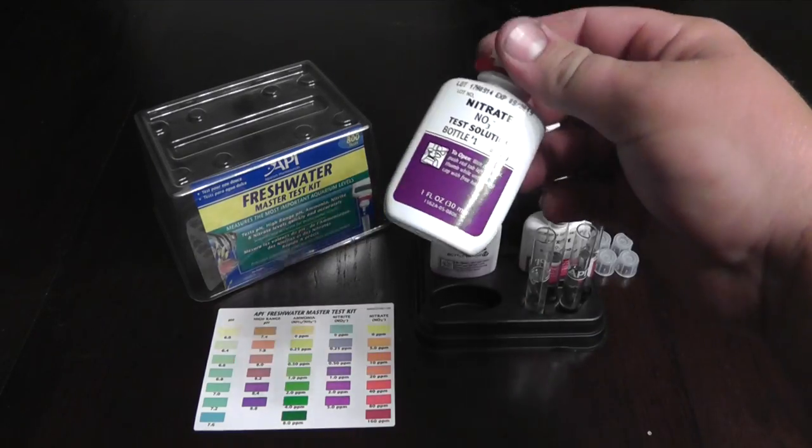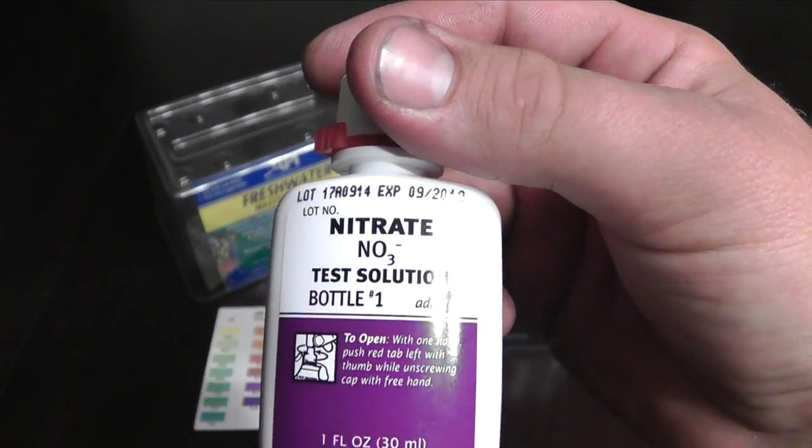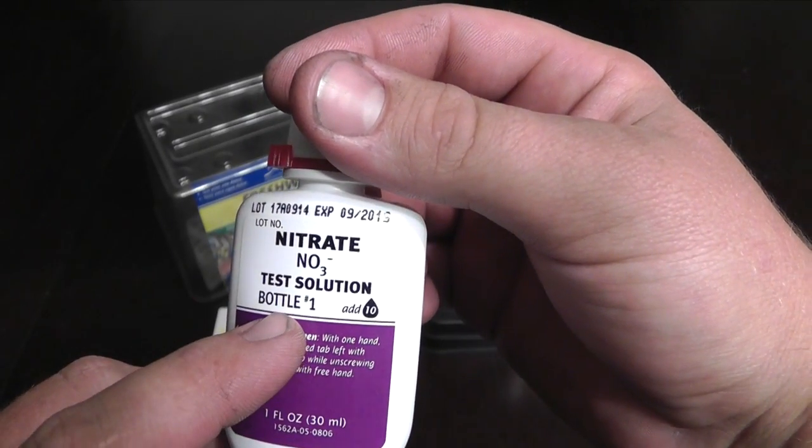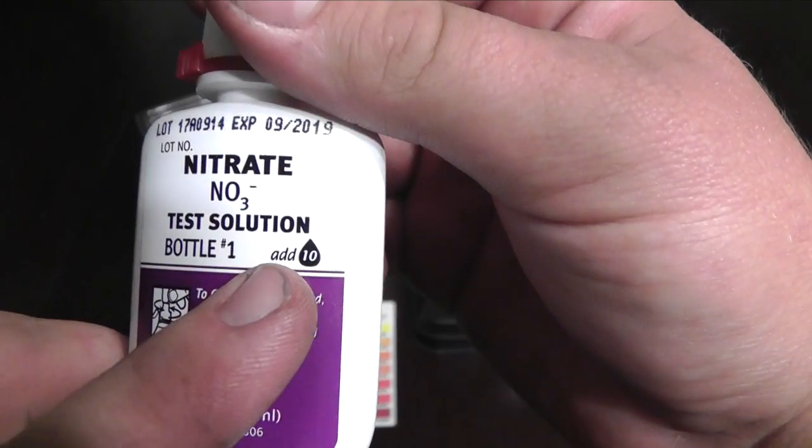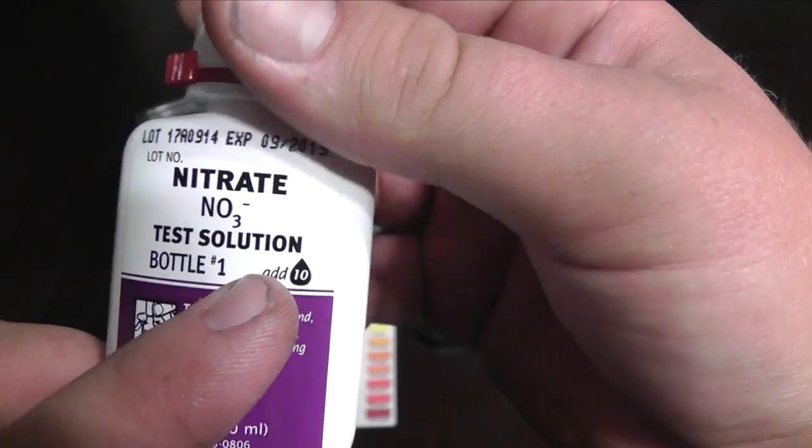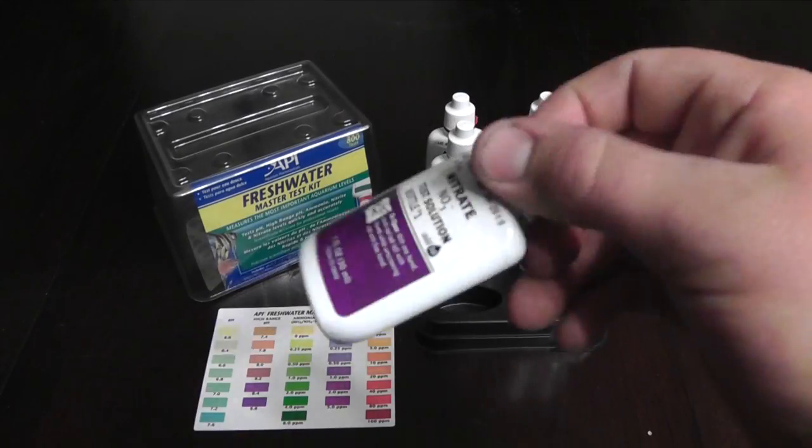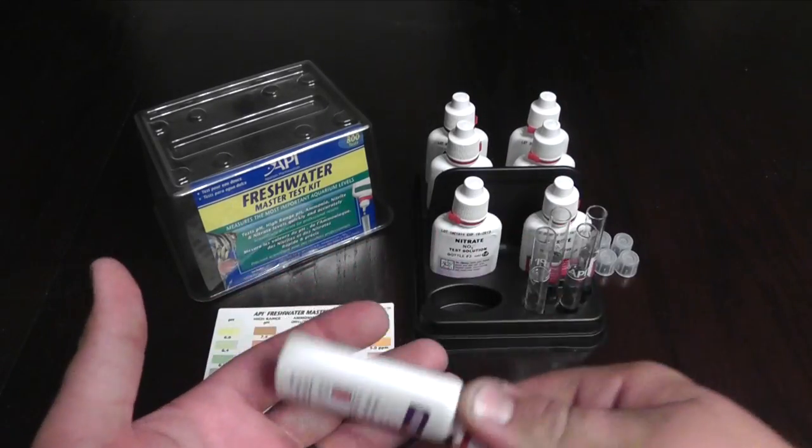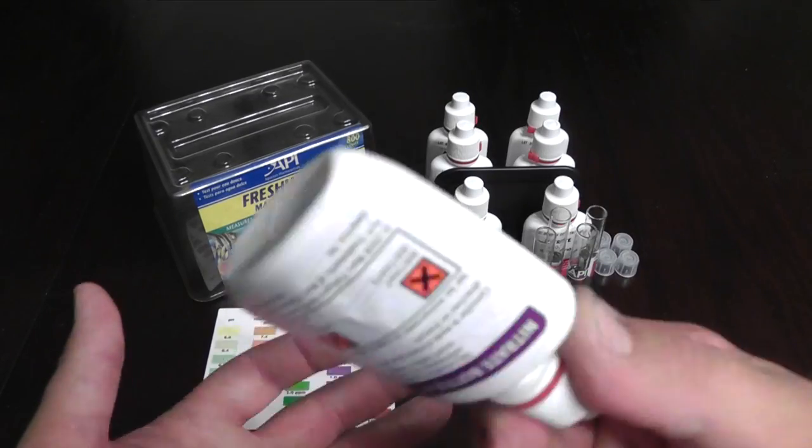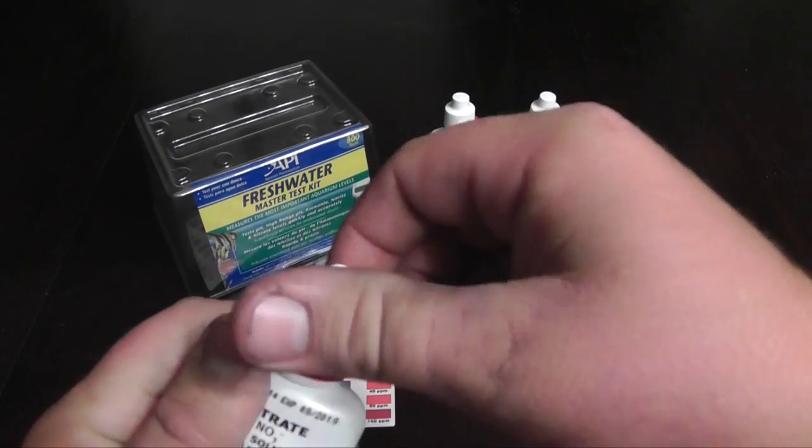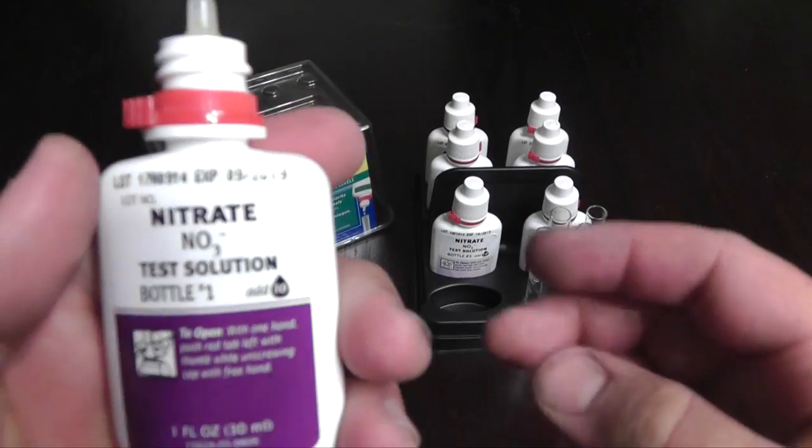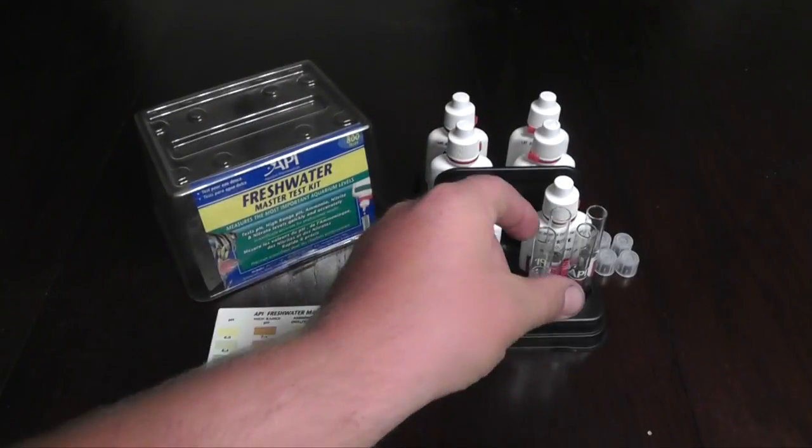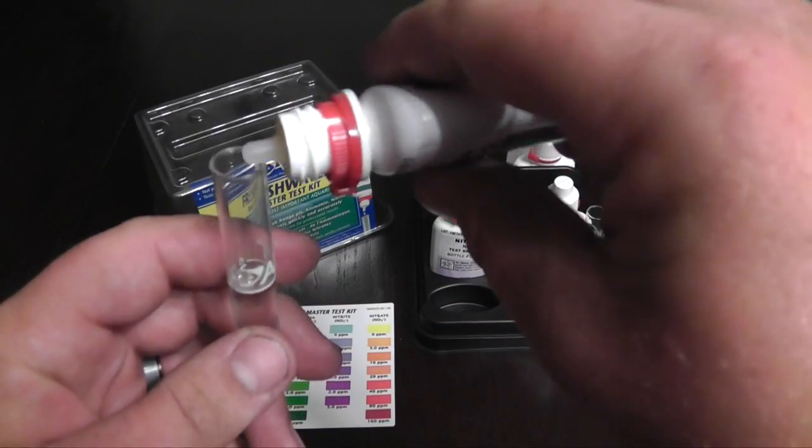Okay guys, first we're going to be testing the nitrates. So you can see right here, this is a nitrate bottle, bottle number one. Start with number one first and I prefer that you shake up these bottles before you actually test the waters because you have to shake up all the pigments and stuff inside of them. So let's do it. Now you're going to add 10 drops to this water as you can see right here.